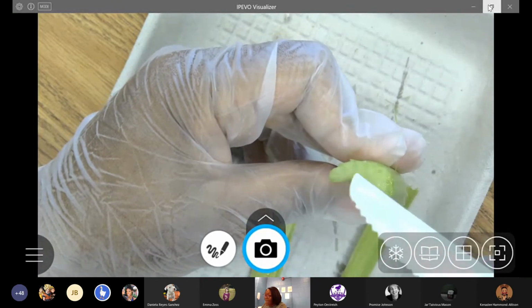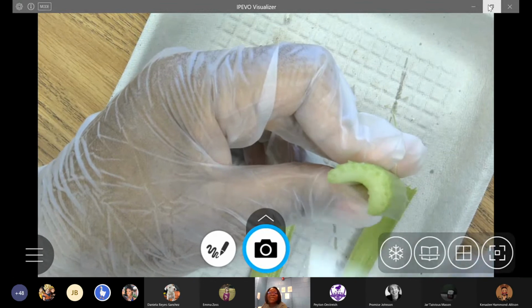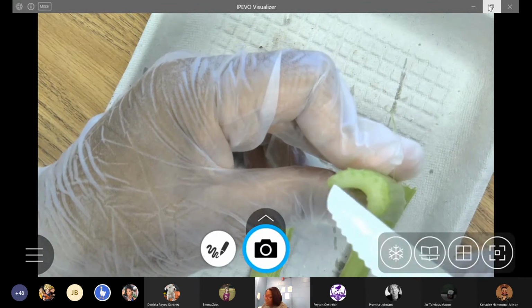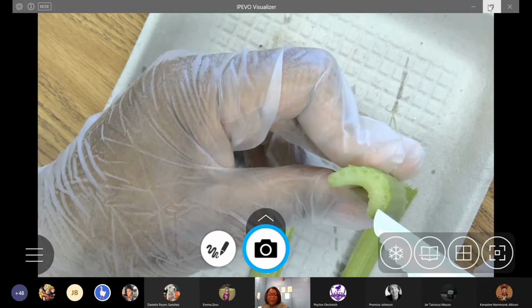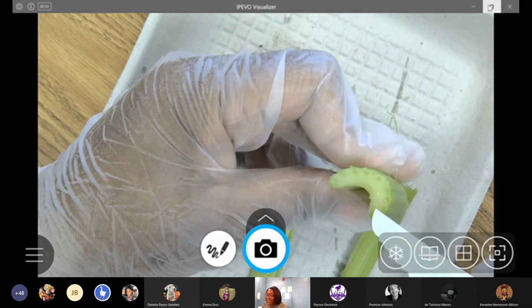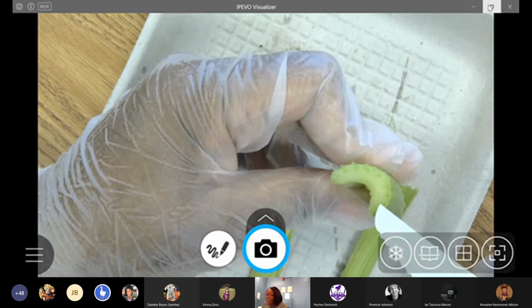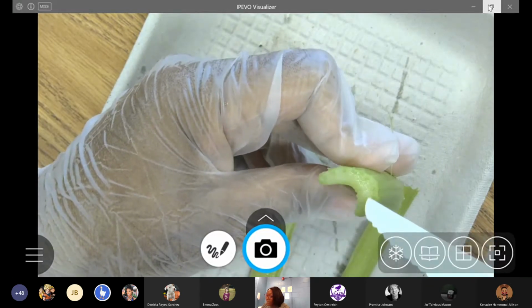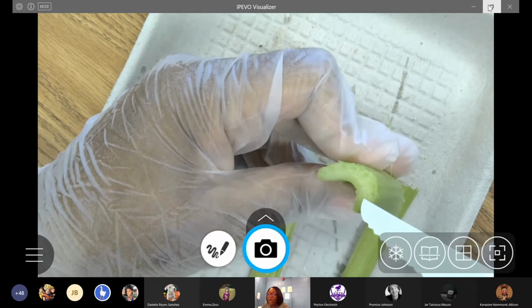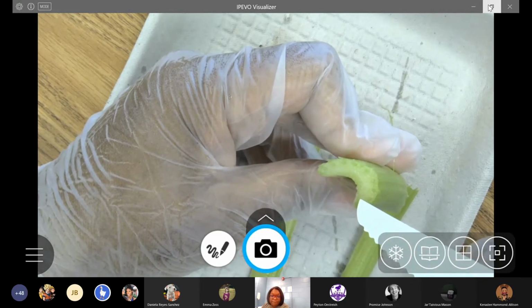The answer here would lie in how that xylem and phloem are so neatly organized. Yeah, you see how they occur in a nice little row here of dark green circles? So this clearly tells us that the celery is vascular. This is a vascular plant because the xylem and phloem are organized in a neat pattern.